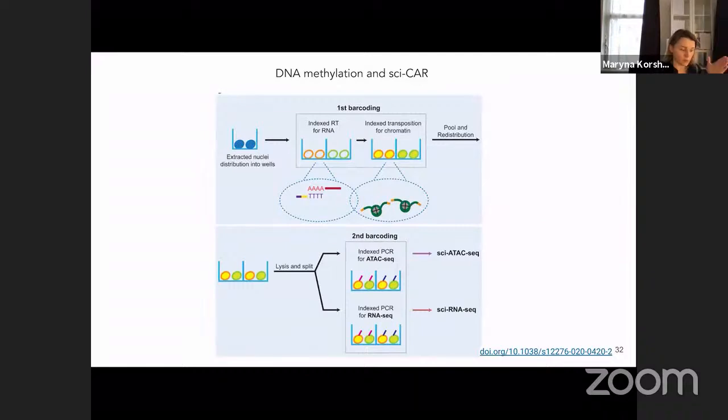So what you can observe from here is that you split your sample in order to be able to do both single cell ATAC-seq and single cell RNA-seq. I highly recommend, if you are interested in one particular protocol, to go deeper into this protocol and look better at what kind of materials and what kind of optimization the authors provide to readers and so forth, because honestly speaking, all of this protocol-related stuff is very technical and not so widely used in everyday practice for people in single cell.